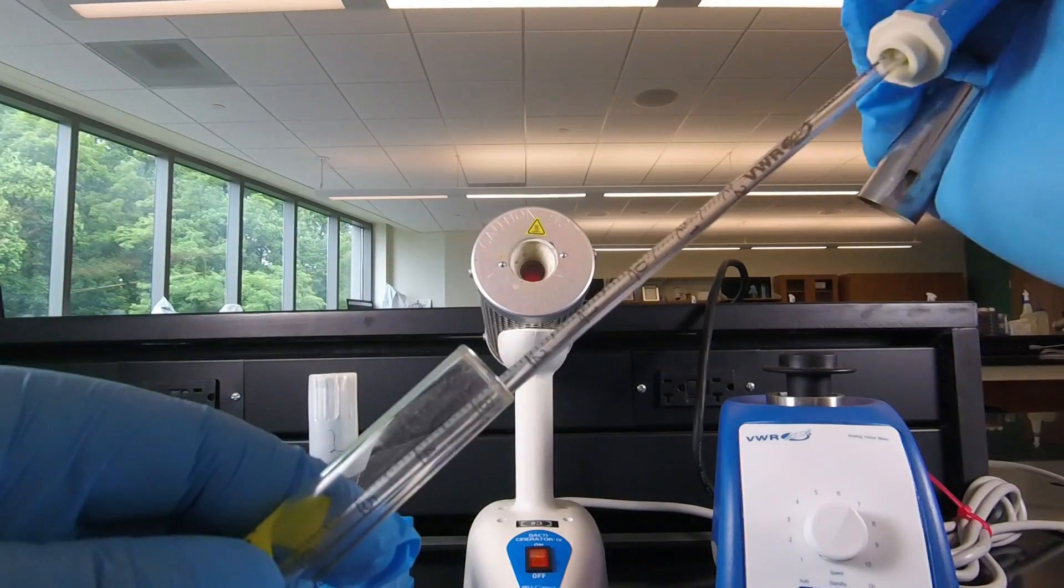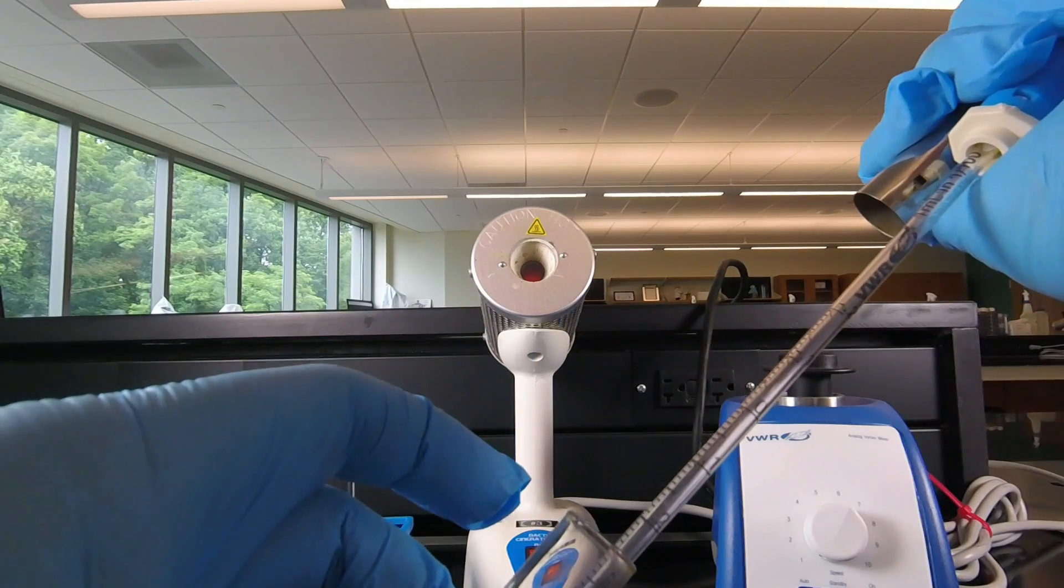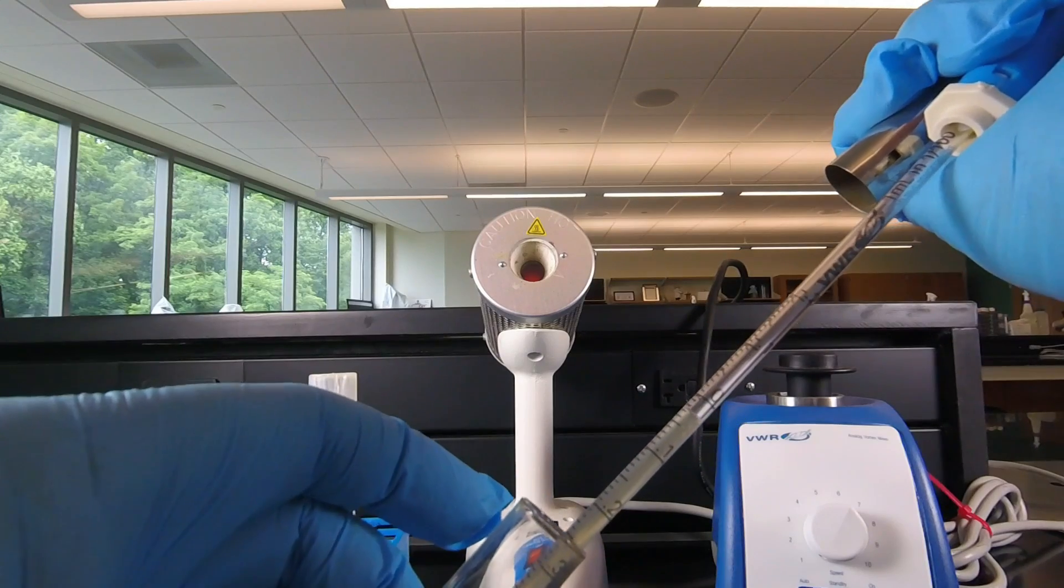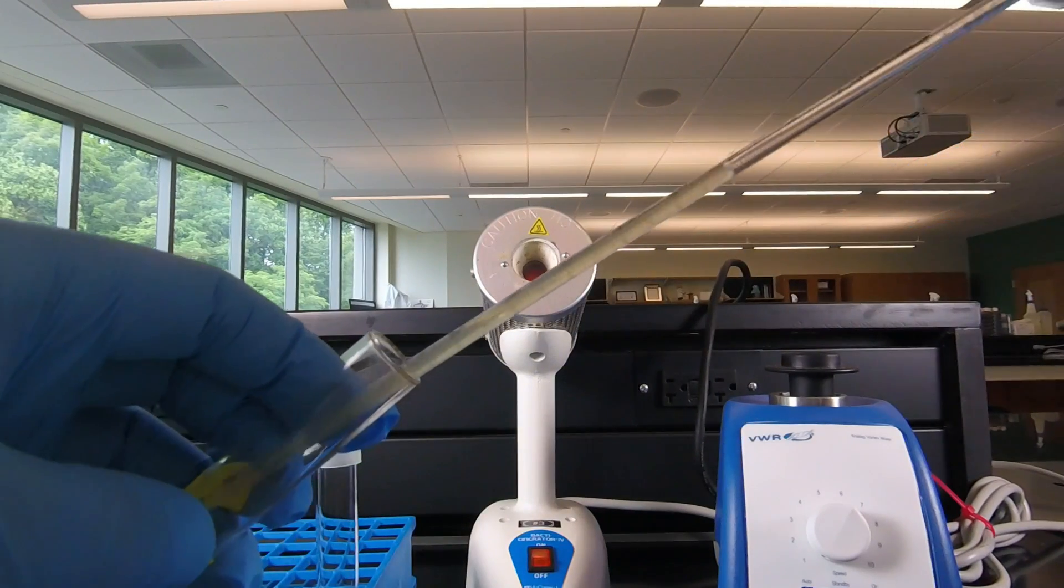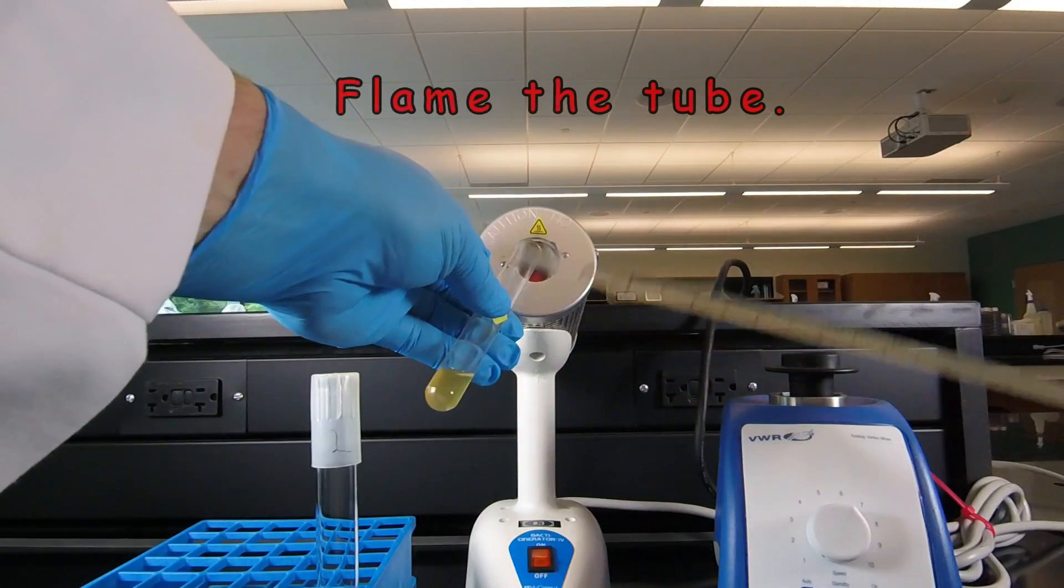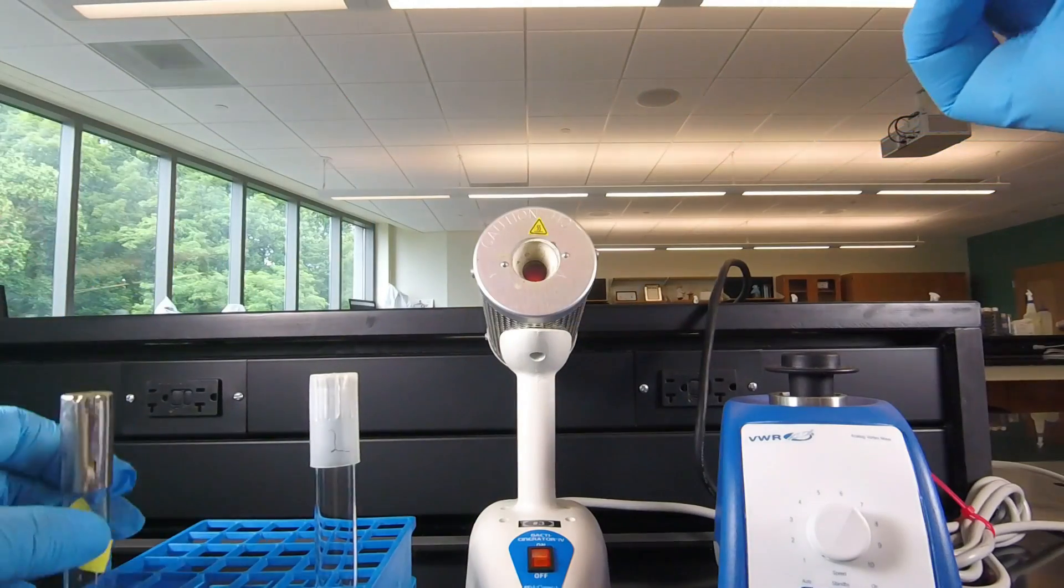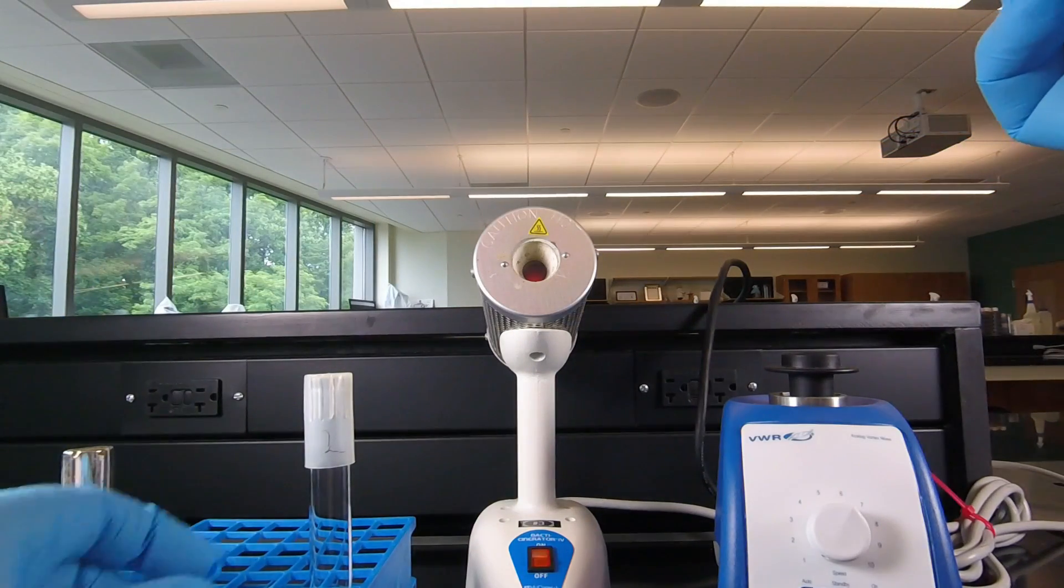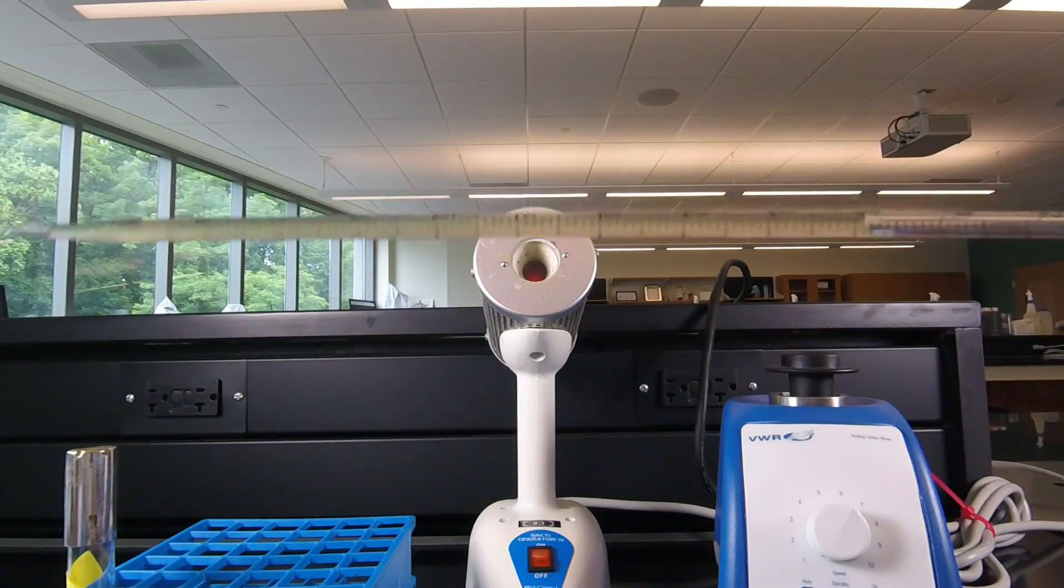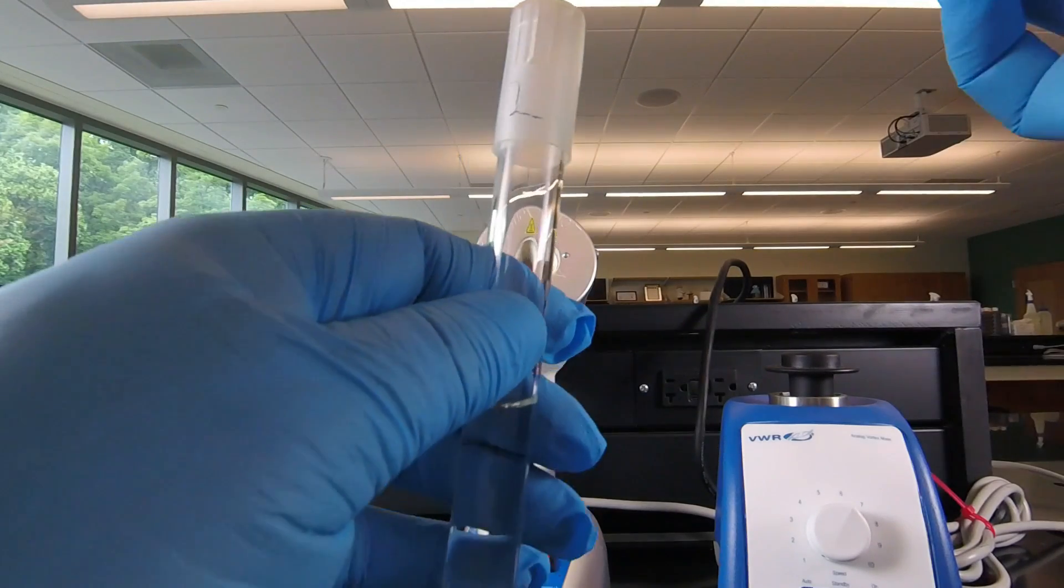We're going to remove one milliliter of the bacteria by drawing it up to the zero on the pipet by turning the knob downwards. And now we have our one mill out. And then we flame the tube, we put the cap back on and we are ready to transfer the bacteria to the next tube. Now if you keep the pipet horizontally there's less chance of dripping too. So kind of keep it horizontal while you're doing that.